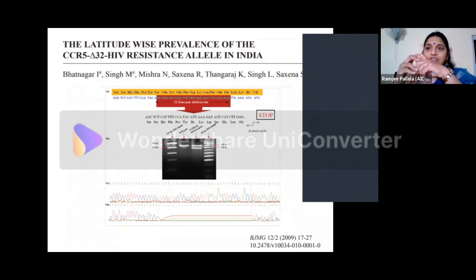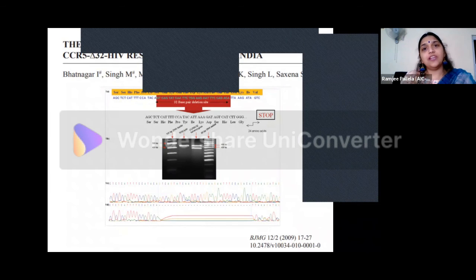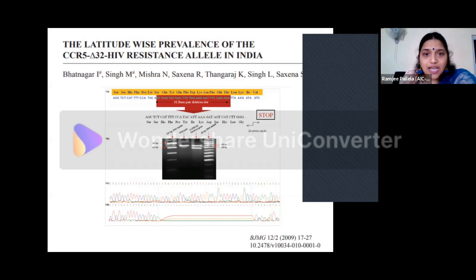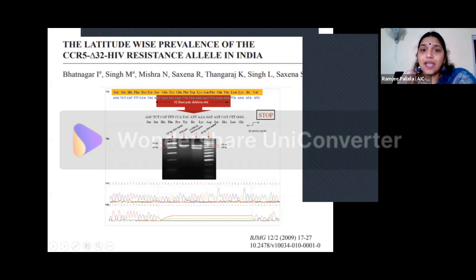Now, if there is any alteration in the sequence of this particular CCR5, the virus cannot enter, right? So I need to check whether all the individuals have the same makeup of CCR5 or there is some deletion mutation, because this particular 32 base pair deletion is known to confer resistance to HIV infection. Okay, so this is the work that I did, and you see here, I have marked in red the 32 base pairs that were deleted, and I did a sequence analysis. You can see down, you can see this page. The agarose gel electrophoresis, where the wild type, there is no mutation, gives a single band. And when you see the heterozygous, you see there are two bands there, right? And both the bands, you can see the difference will be more or less 32 base pairs only. So this is the exact sequence that is not available in some particular individuals.